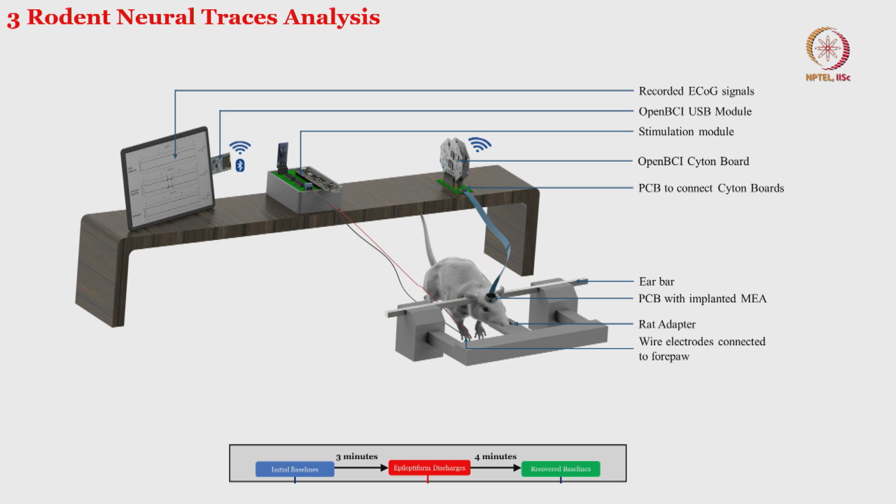I would be showing, once you have fabricated the microelectrode array, performed neurosurgery, and placed your implants at the proper or desired anatomical level of the rat's brain, and then you get the data, how to read that data and how to show the differences in that data. So this is a small setup.